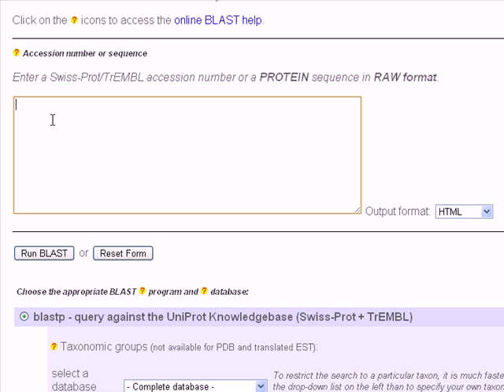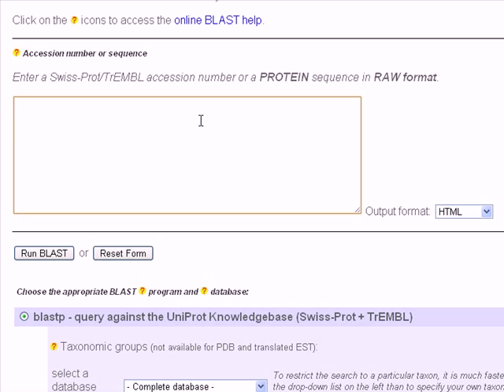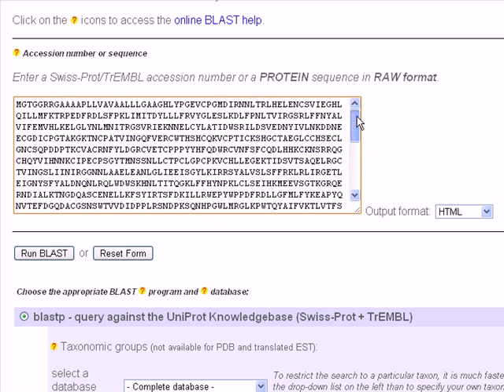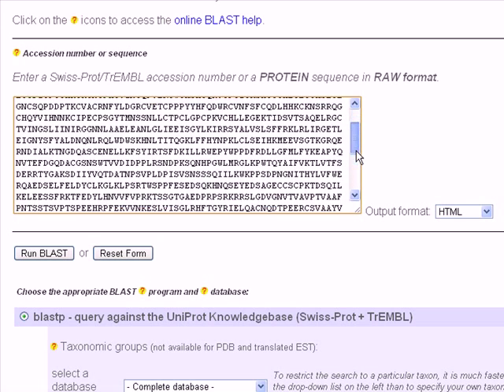We paste our sequence here, our protein sequence in RAW format, which means only the sequence, not the first line of the FASTA format, which contains the database name, the accession number, protein number, protein name, the organism name. We paste our sequence. As you can see here, I pasted only the sequence.